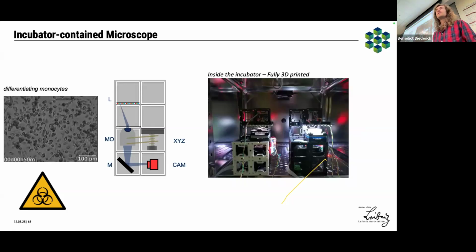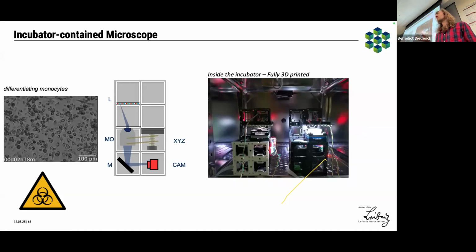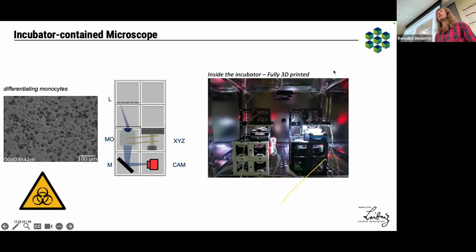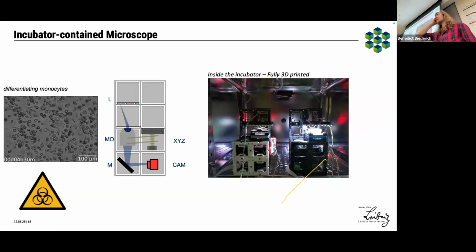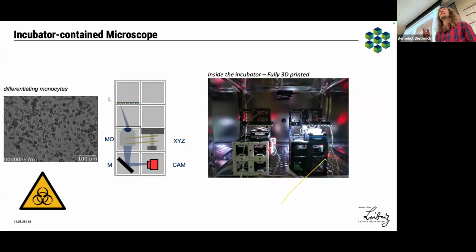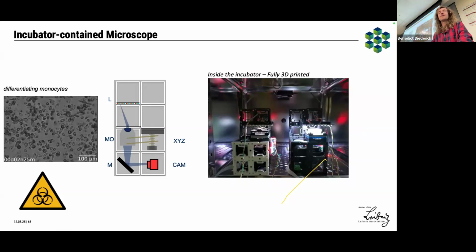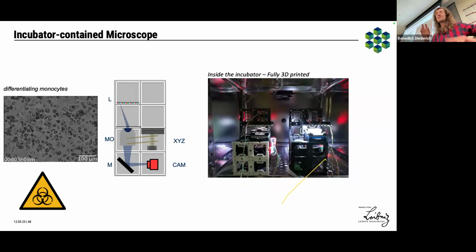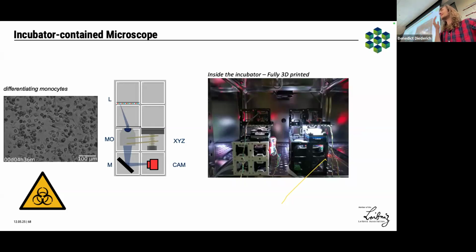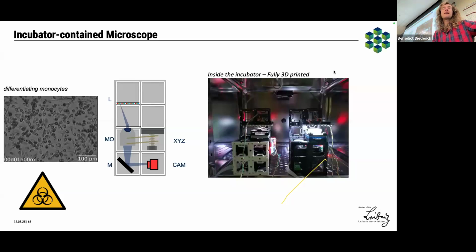And then you have the ability of replacing or using a microscope, which you would probably not have in the other place, because the original idea was from this person, which I can use for observing these macrophages for, say, 2 weeks, and I cannot block my Zeiss microscope because everybody's using that. And then, which I would really like to train a little bit, is the idea of optical tweezers, which I think is a pretty cool idea.